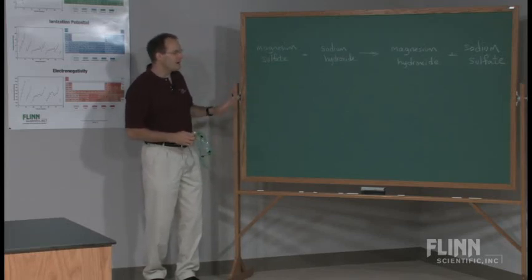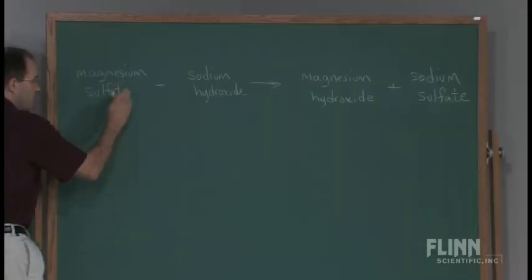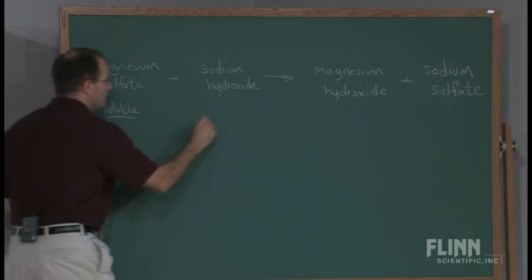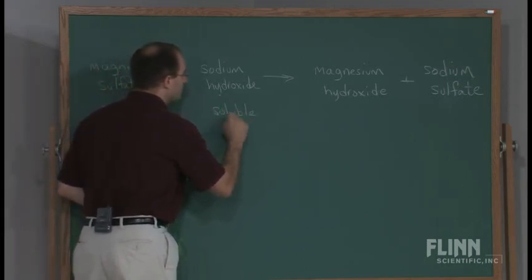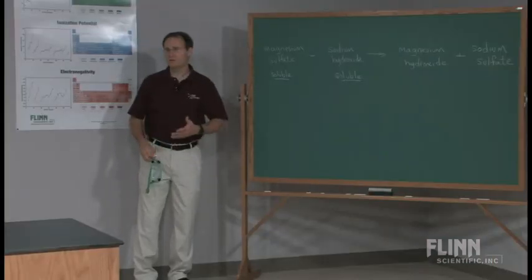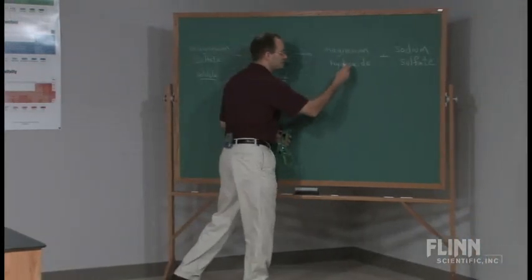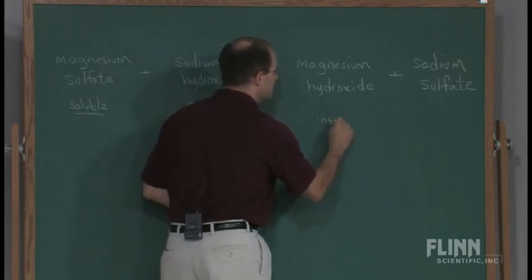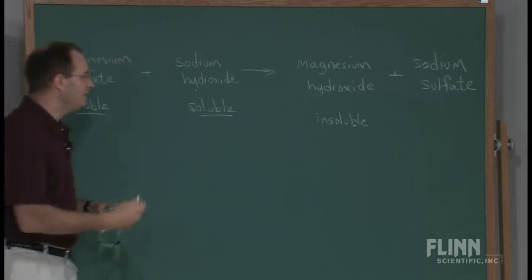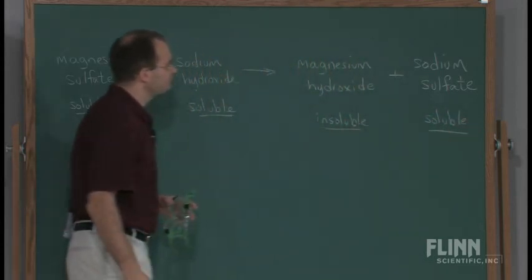Well, another topic that we've talked about would be solubility. Well, I know because I dissolved each of my starting materials in water that these two are most definitely soluble in water. We could look up on a material safety data sheet, or we could look in the Merck Index or solubility tables, and what we would see is that this substance, magnesium hydroxide, is insoluble in water. Sodium sulfate, again, we could look that up and we would see that that is soluble in water.